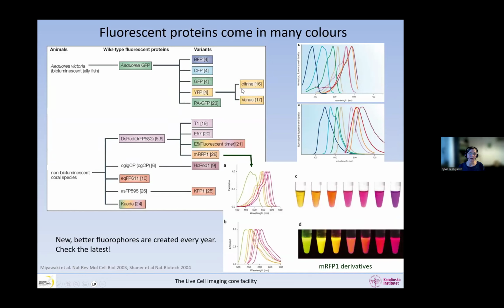The proteins have also been evolved a lot, and I think I spoke a little bit about this in the exercise where you have to find the exact name of your fluorophores. The field keeps on going, very much evolving the proteins towards the red and the far red, so there's a vast range of red and far red proteins. They all have different spectra, so you really need to check the spectra, and we get lots of different, better fluorophores that come up brighter, more stable, etc.